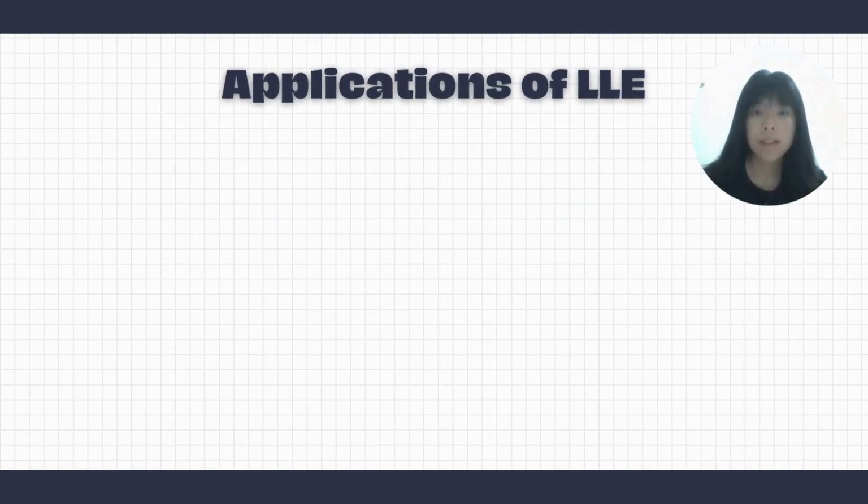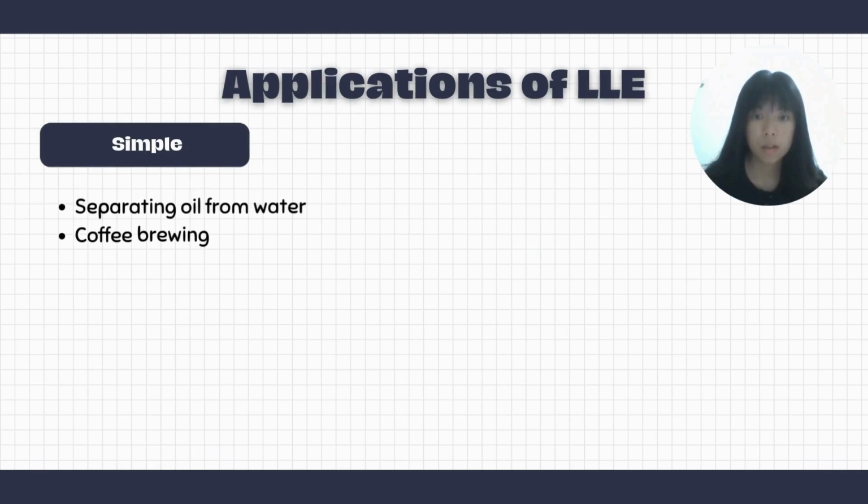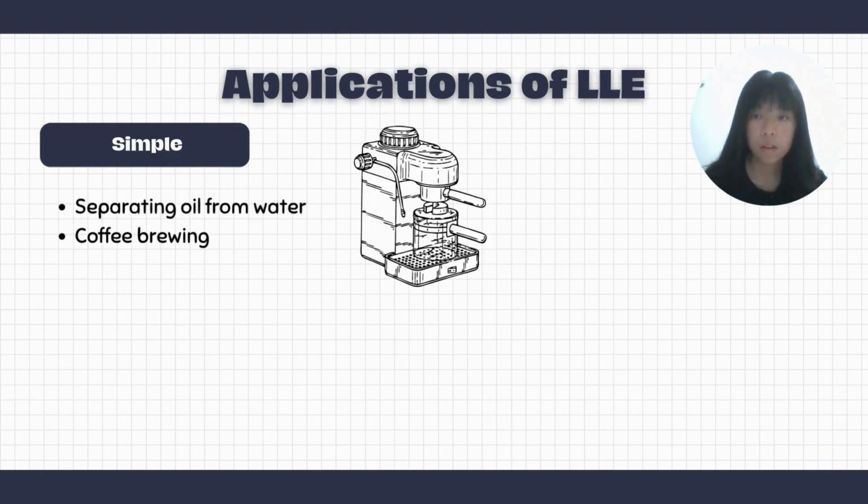There are various applications of liquid-liquid extraction ranging from simple to industrial scale. In our daily lives, common examples include separating oil from water and brewing coffee. Coffee brewing is considered a form of LLE because water extracts the flavors from the coffee grounds.